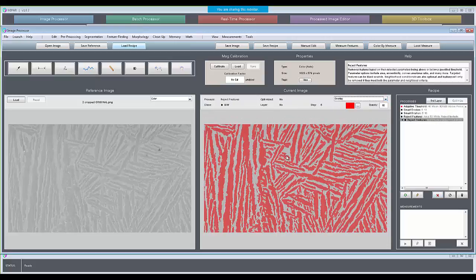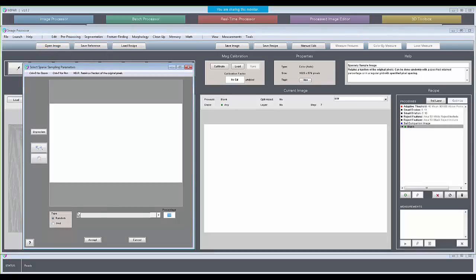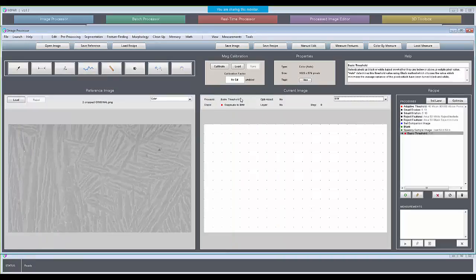Here's our selection where we have all of the features of interest selected. I'm going to put this as companion and then go and do my grid setup. So here's a blank grid, sparsely sampled. We're going to use a grid with a step size of 50 pixels in between. Work around this issue of it being a grayscale image here.